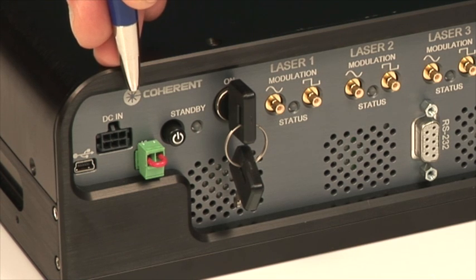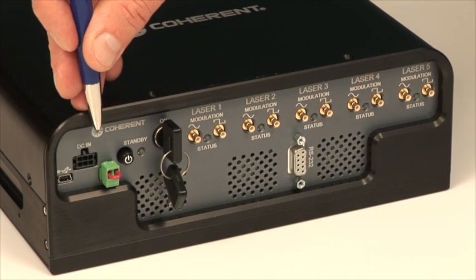The power coming into the laser box is a single connector. This is 12 volts of DC power that will operate each of the five lasers, all of them simultaneously, as well as the thermal management.